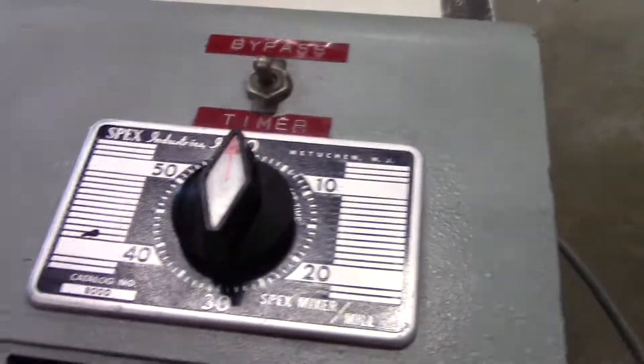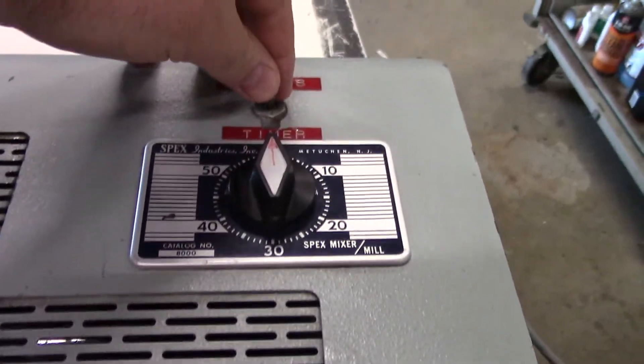It has a 60-minute timer. It also has a bypass to the timer.